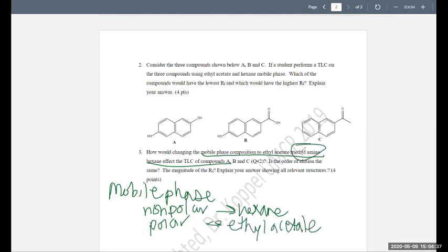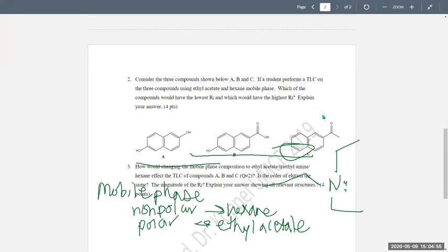And then we're like, what is triethylamine? So I need to draw the structure. If I don't know what it is, it's just 3 ethyl groups with an N in the middle, and it looks like this ninja star or something. Basically, even more than just polar, yes, it is polar. This is polar.